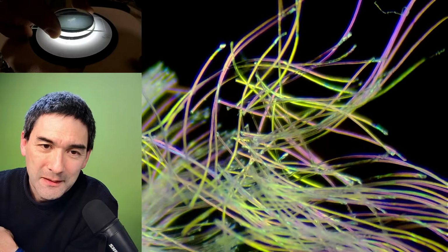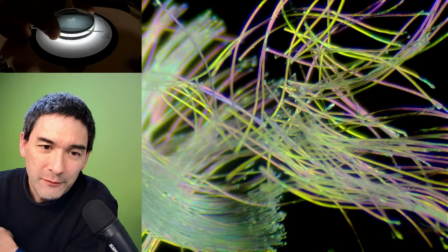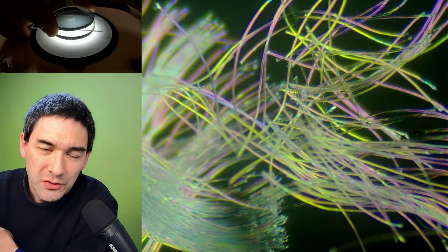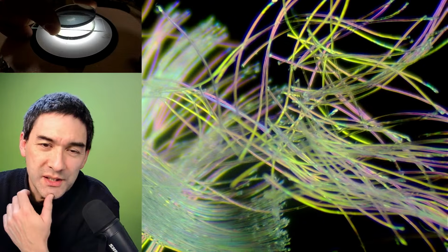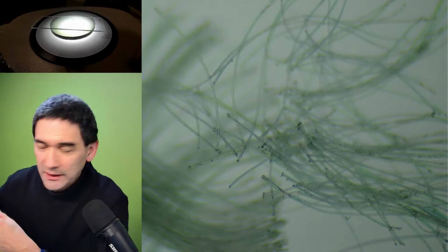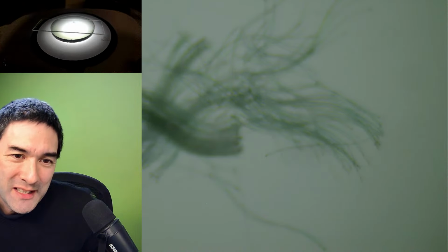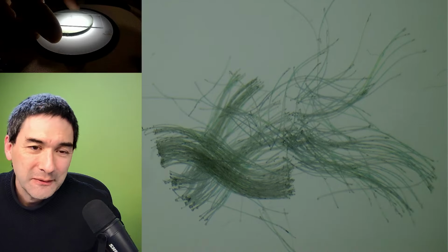So these are again white fibers. This can indeed also be used a little bit to differentiate the natural one, and they look way more regular than the ones that I showed you at the beginning, right? So let's do the following. It's kind of obvious what I'm doing right now and what we can expect. You actually don't even need a microscope for that.